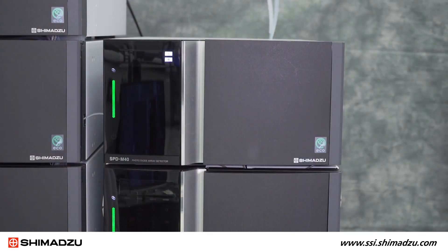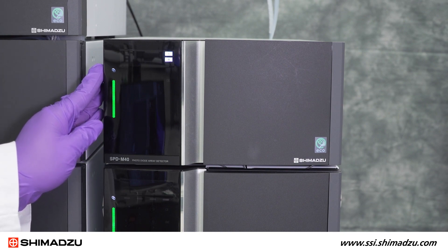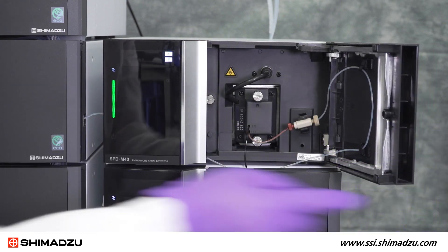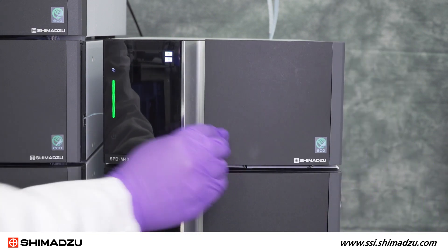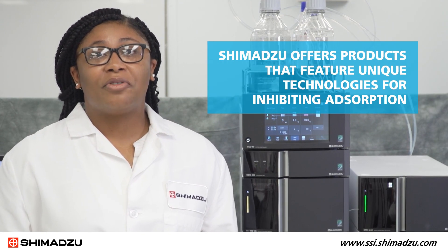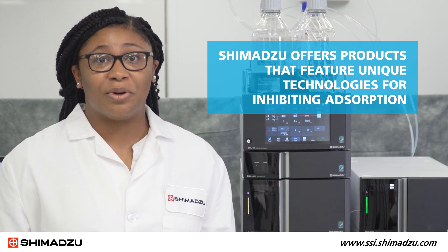Above our column oven, we have our SPD-M40 photodiode array detector, or PDA. This detector utilizes an inert UHPLC flow cell that features PEEK tubing and PEEK cell housing. Adsorption of biomolecules can occur not only within instruments, but also in vials, columns, and other equipment during sample preparation. Shimadzu offers such products that feature unique technologies for inhibiting adsorption.